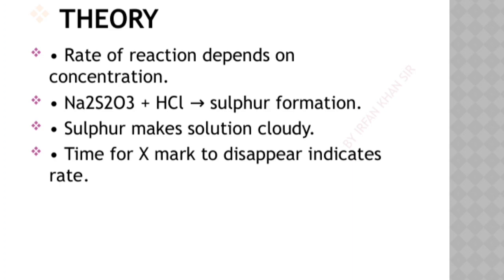When they react, sulfur is formed as a product. This sulfur isn't very soluble, so it makes the solution turn cloudy or opaque. This cloudiness is actually very useful because it allows us to measure the reaction's progress visually.